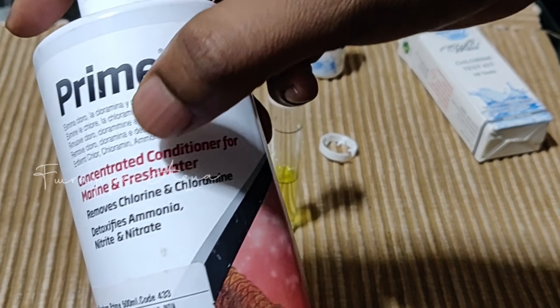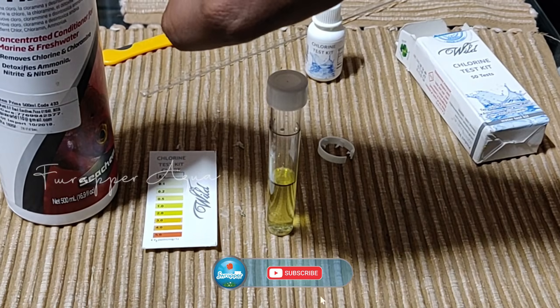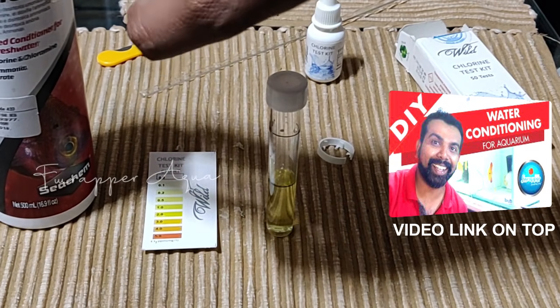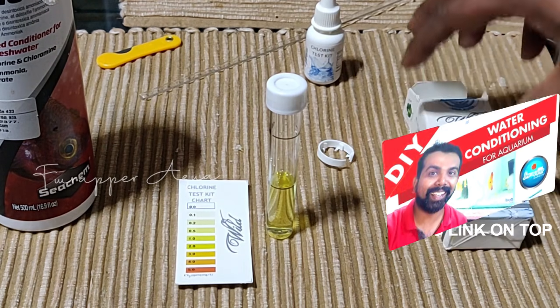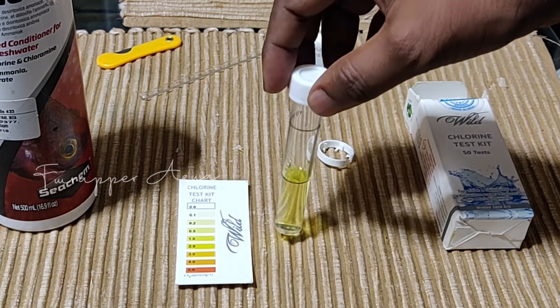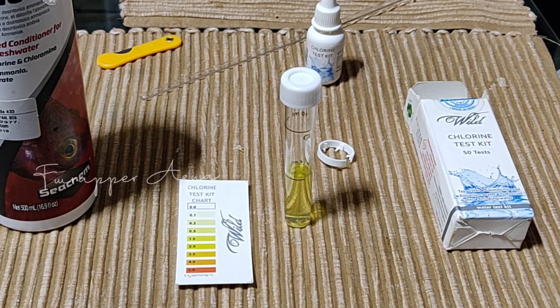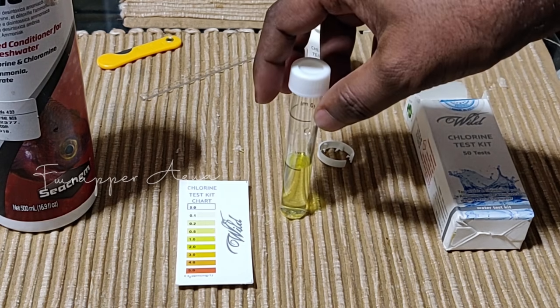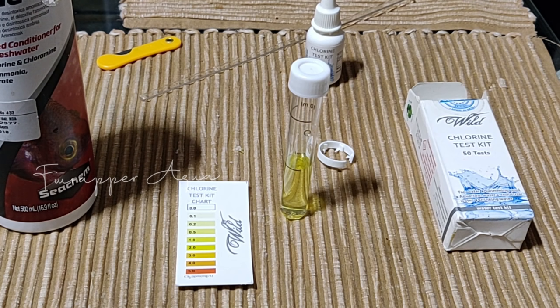With aging and the addition of Seachem Prime, the water is completely safe for fish. As I said earlier, having these kinds of kits which are not very expensive is very handy. I waited for a day to get this fresh water sample, and of course I needed to make sure the test kit was working fine.